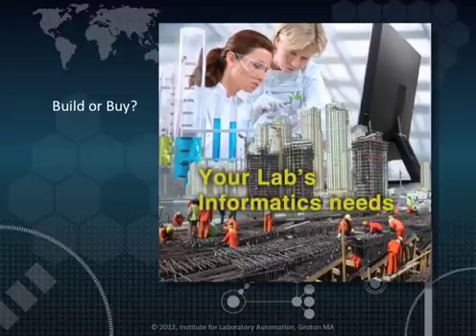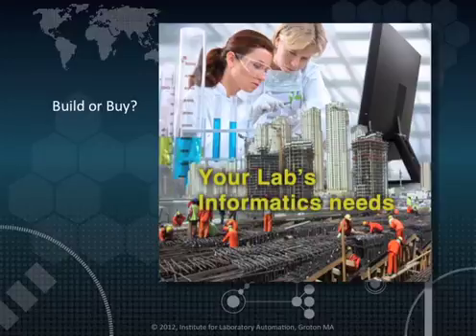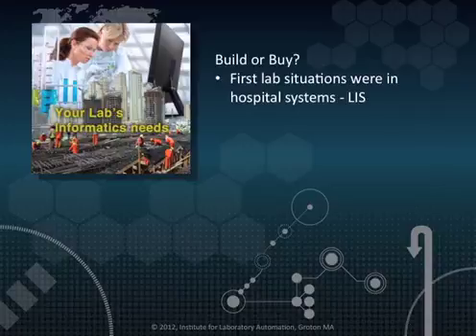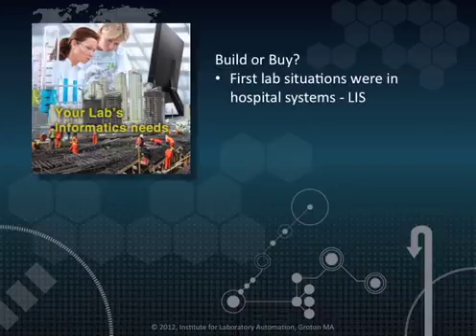When evaluating your laboratory's informatics needs, one consideration that comes up is whether or not you should buy commercially available products, or is it more cost-effective to build one for your laboratory program? This question first came up when hospitals were considering laboratory information systems, functionally equivalent to industrial laboratory information management systems. One study concluded that at best, an in-house built system would approach the capabilities of a vendor-supplied system, but only for a short time. Vendors were much more capable of improving products than in-house technology groups.